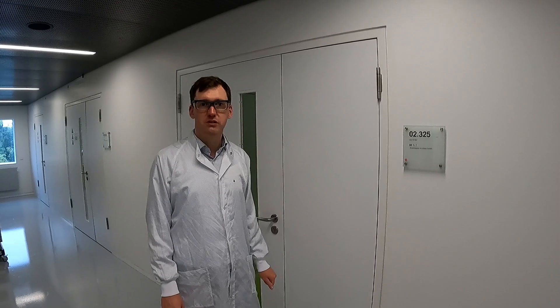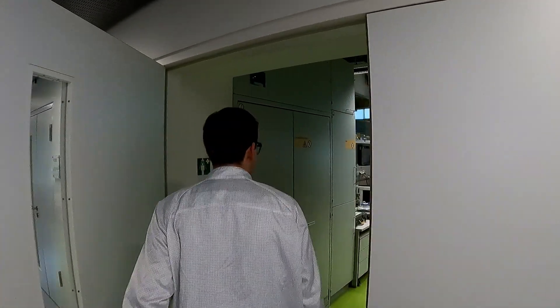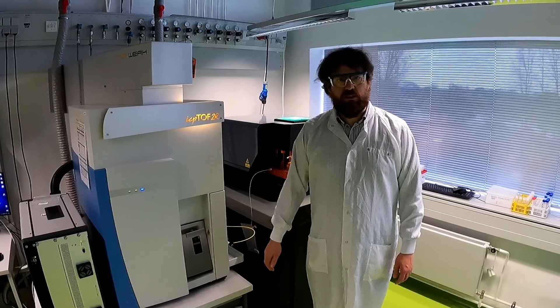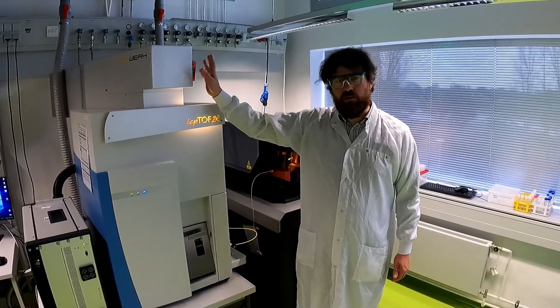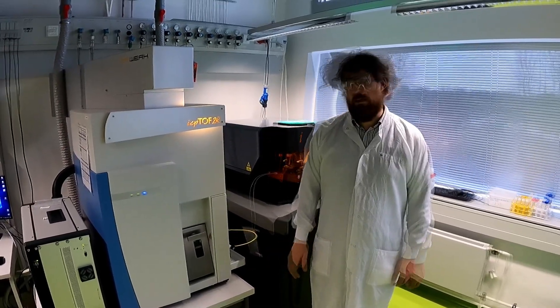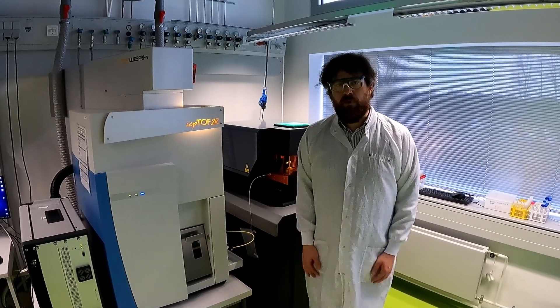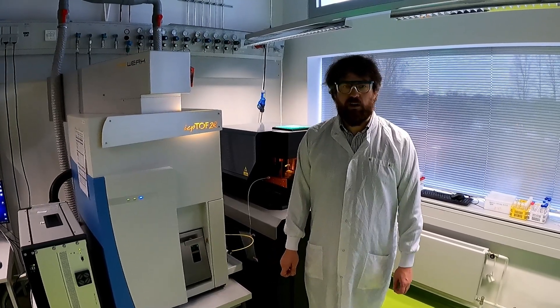I would like to introduce you to a further PhD student, Markus von der Au, who is currently working with our ICP-TOF-MS system. This system uses a plasma at five to six thousand Kelvin to analyze metals. The beneficial part is the TOF analyzer, which allows determination of the whole periodic table in a very short time. This method is particularly useful for single cell and single particle ICP-MS, as well as laser ablation.